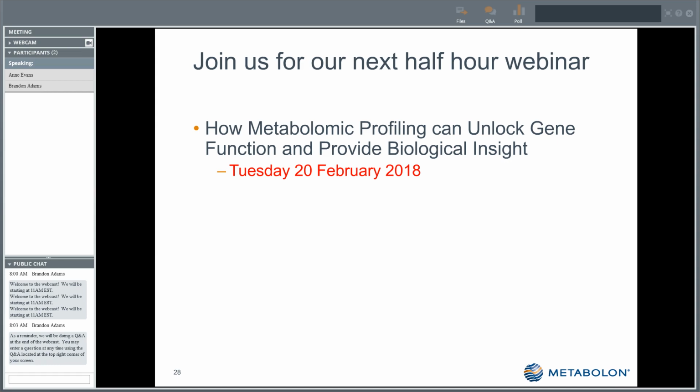So I'm just going to read some questions off here. When studying many genotypes, for example, over 300, the diversity comparison or GWAS, how do you handle missing data or data normalization? So missing data is obviously something that all the different omics technologies have to find ways of handling.